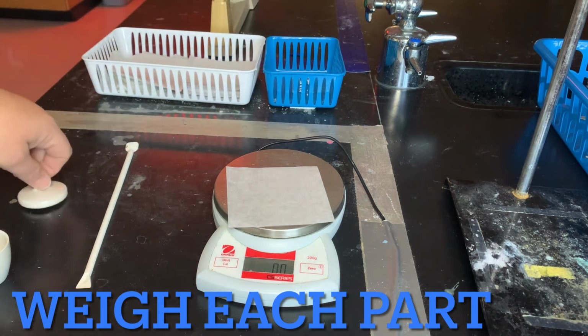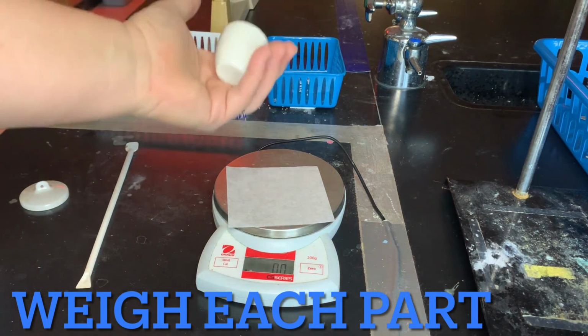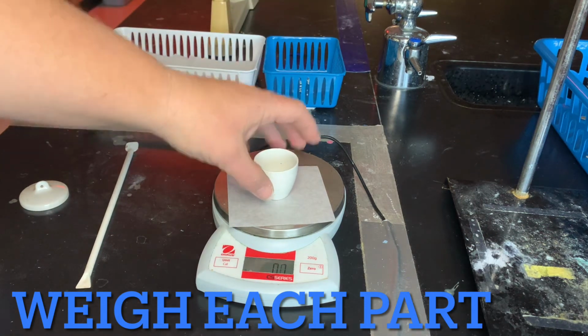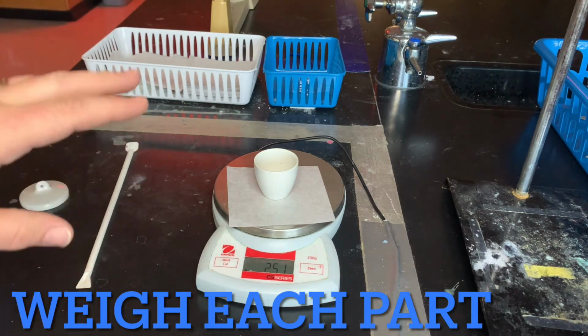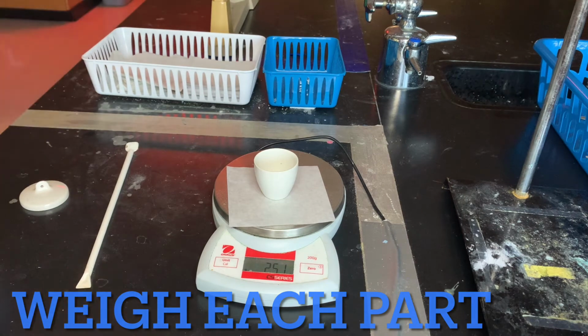And then here's my crucible. Again, I can hold it in my hand so it's not too hot. Place it on the scale, weigh it, and record it. We always weigh the two parts separately in case you break a lid or a crucible.